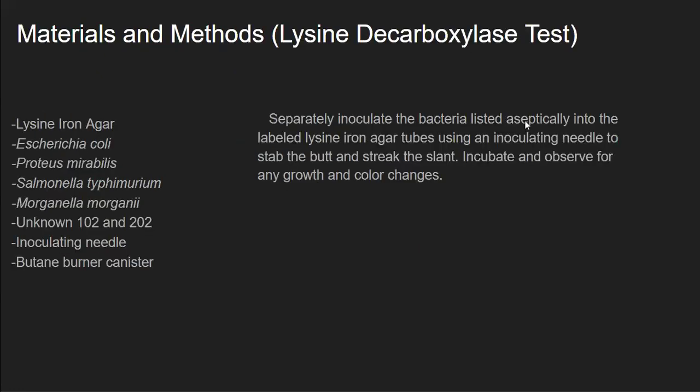Materials and methods. Lysine decarboxylase test. Separately inoculate the bacteria listed aseptically into the labeled lysine iron agar tubes using an inoculating needle to stab the butt and streak the slant. Incubate and observe for any growth and color changes. And these are the materials.